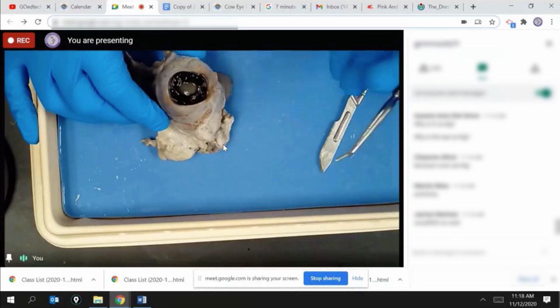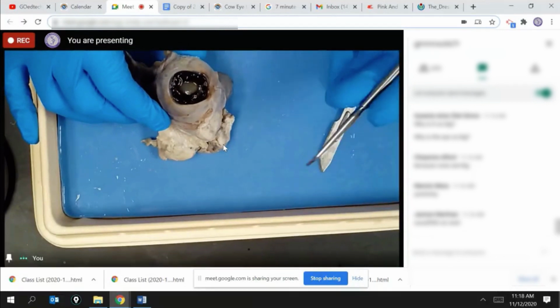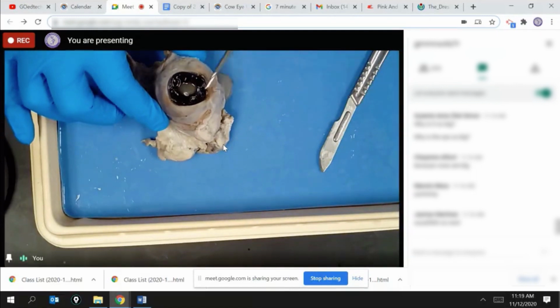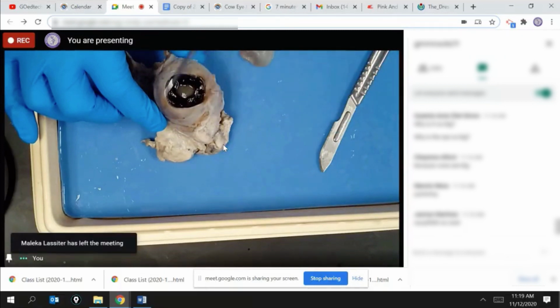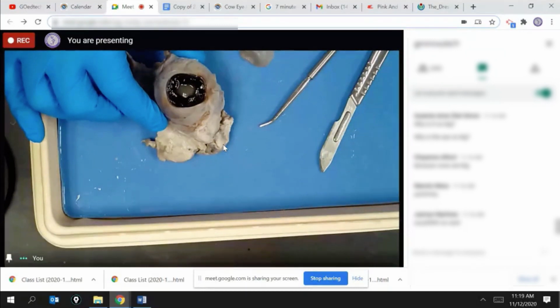You're going to label this on the pictures I gave you, but really you're going to label where it is. You're not going to label the water itself because there's not really a way to do that. So it's right on the underside or the other side of this cornea. So if I had the cornea here again, underneath that would be the aqueous humor, and it would fill this chamber here with that substance. Okay, there's also another liquid, quote unquote, piece in the posterior chamber, and we're going to talk about that when we get there. Okay, so cornea should be labeled, so should your aqueous humor.